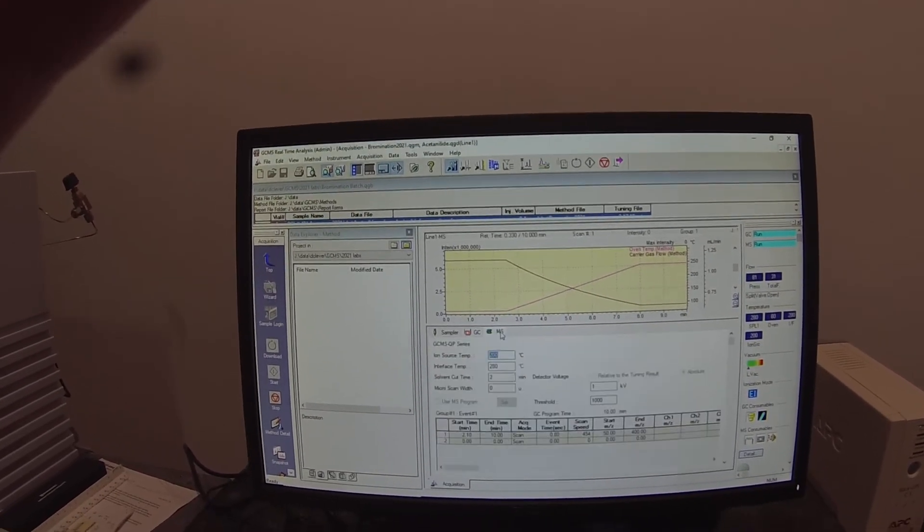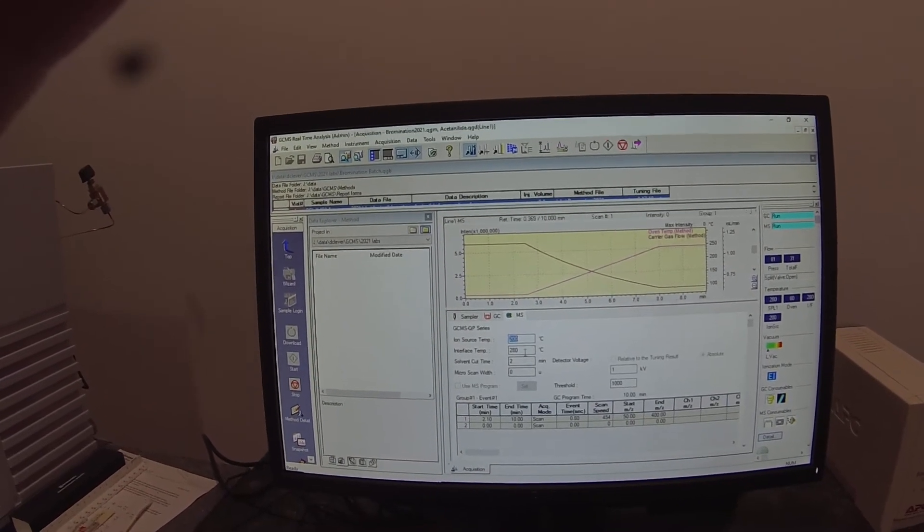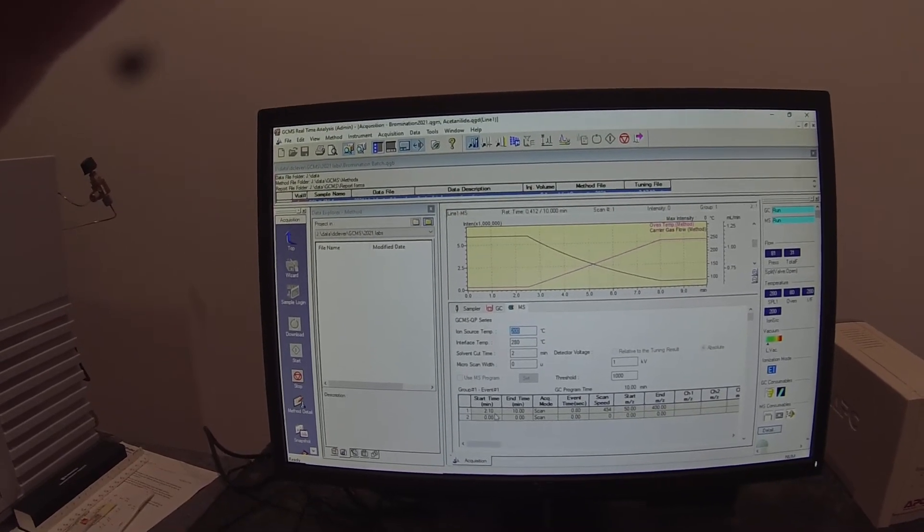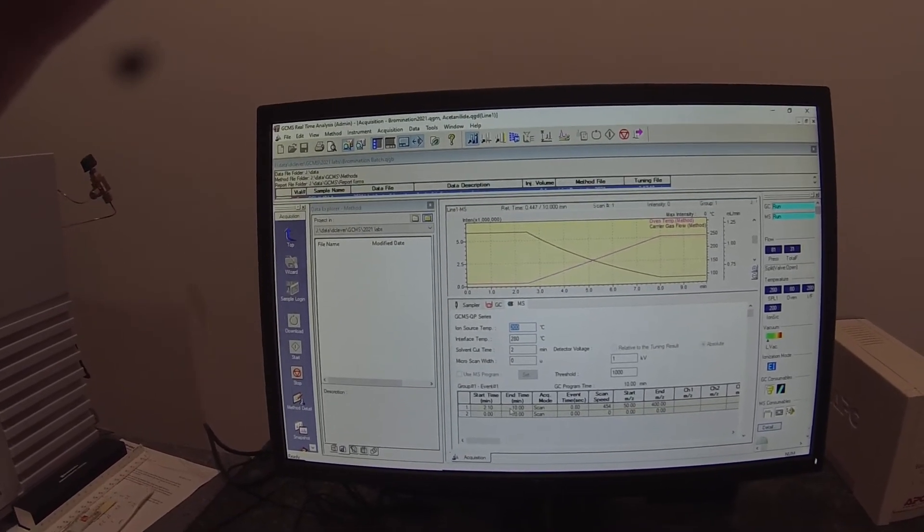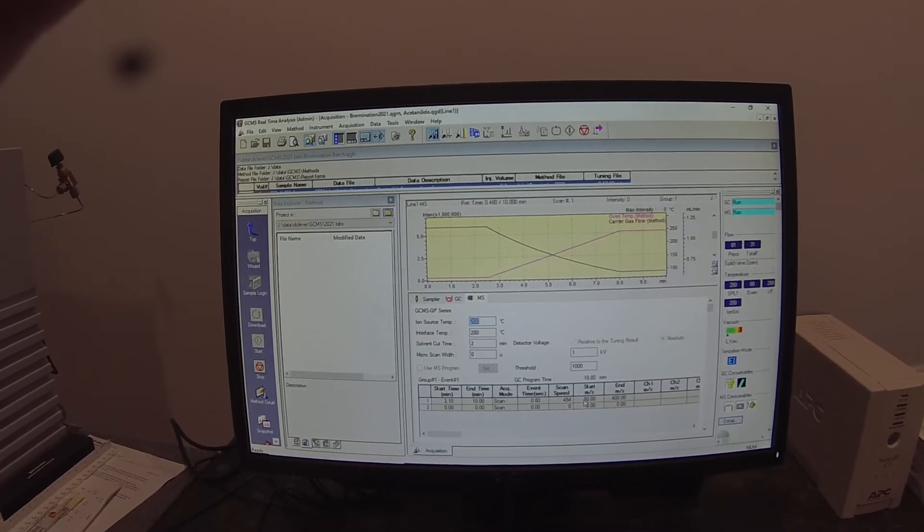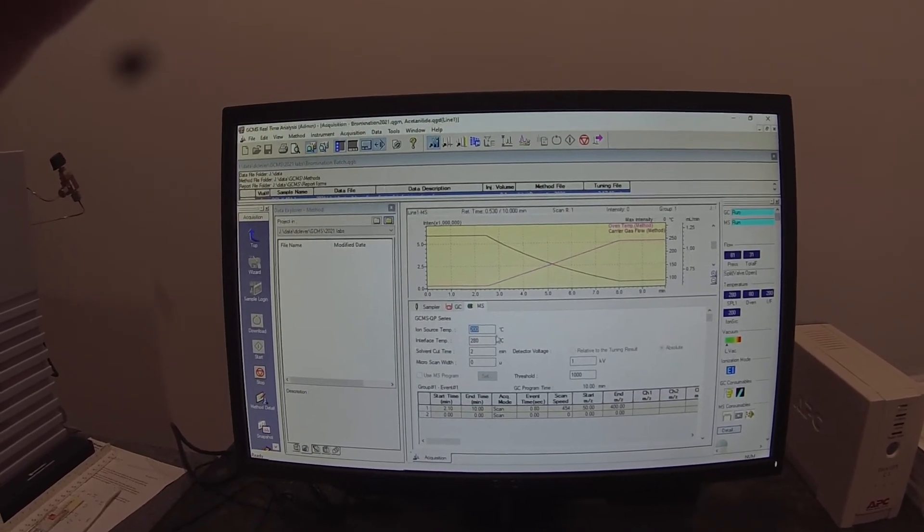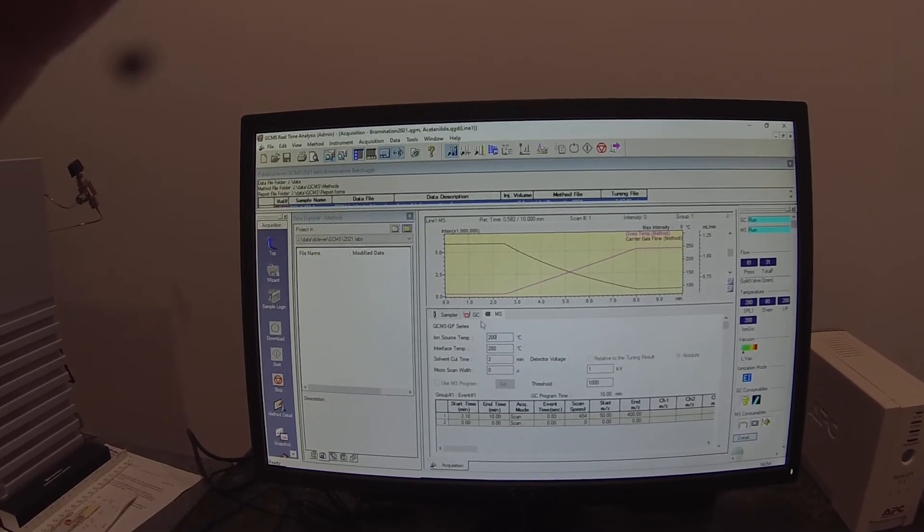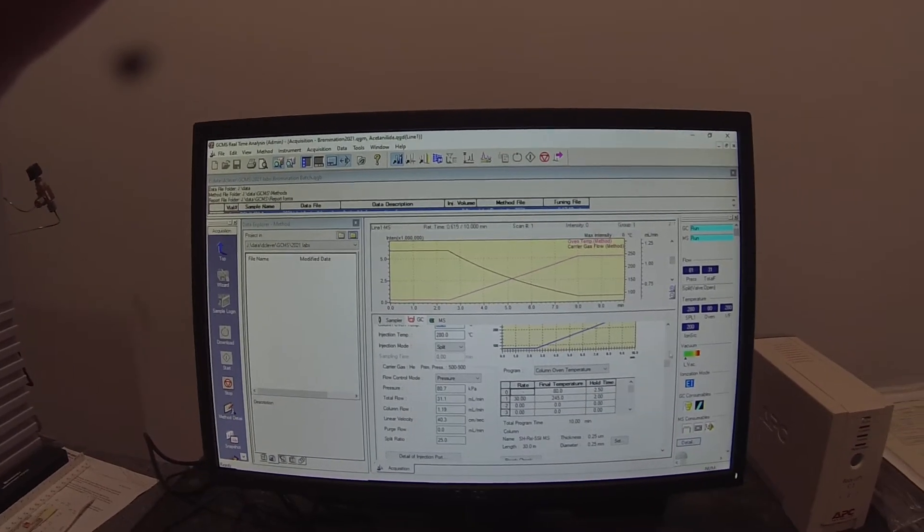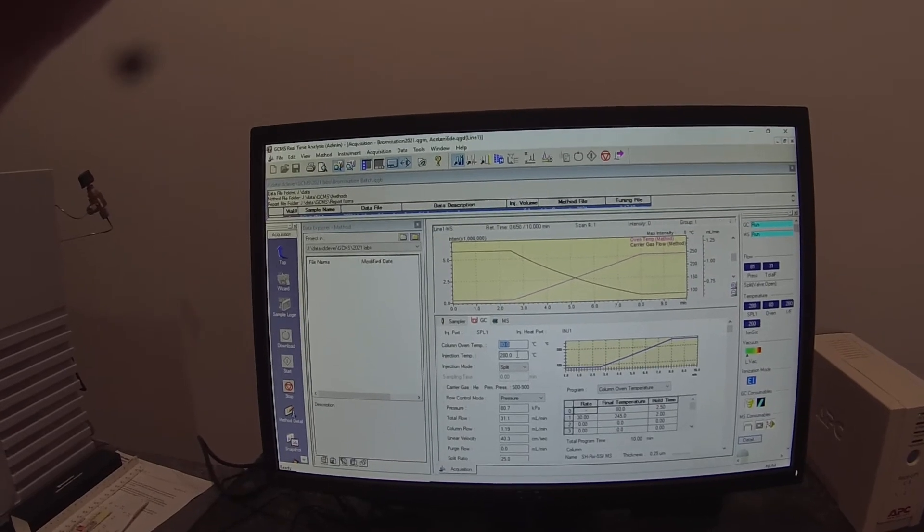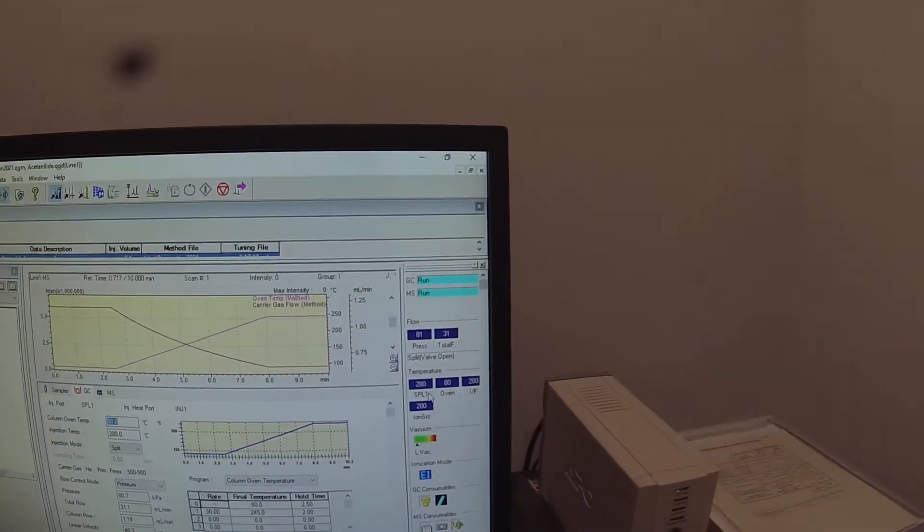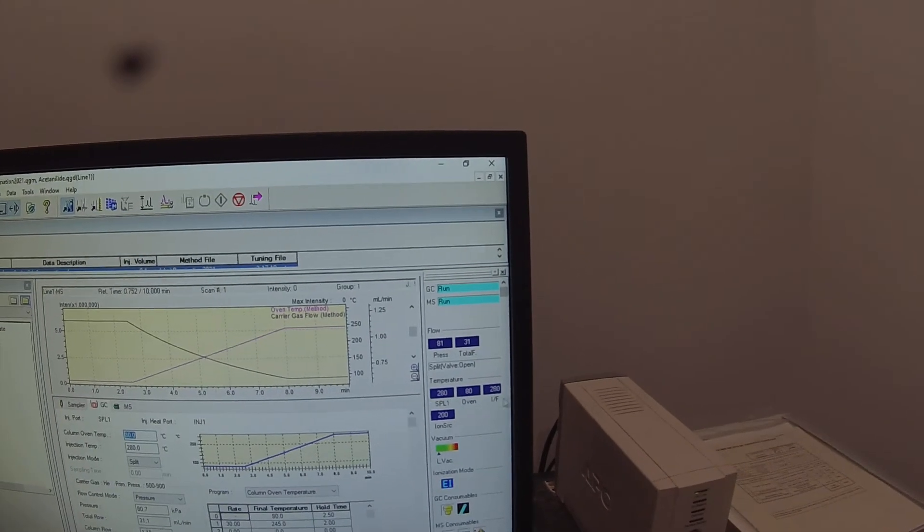Under the mass spec tab we've got a solvent cut time of two minutes where the methanol will come off and then we're collecting data from 2.1 to 10 minutes at a molecular weight range from 50 to 400. The interface is at 280 and the ion source is at 200 and I forgot to mention that the injection port temperature is also at 280. That's also over here.